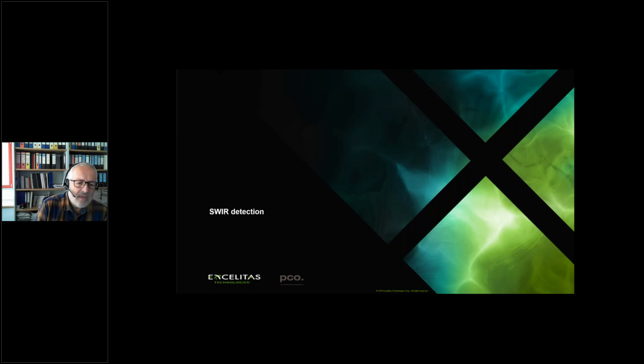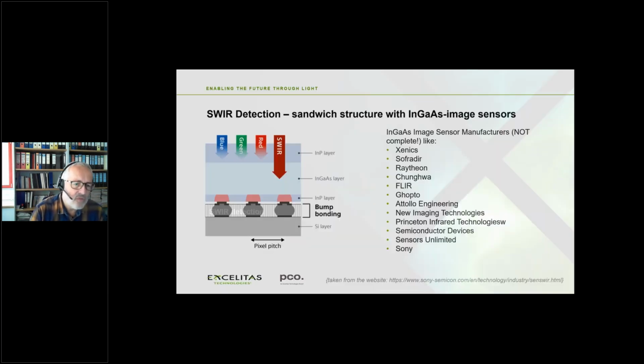Well, if we go to the pure image sensors, then usually you need a material that can generate charge carriers with the energy that is given by shortwave infrared radiation. Typical silicon detectors, which are used for cameras in smartphones and in scientific cameras for fluorescence measurements, for silicon, the energy is not enough.